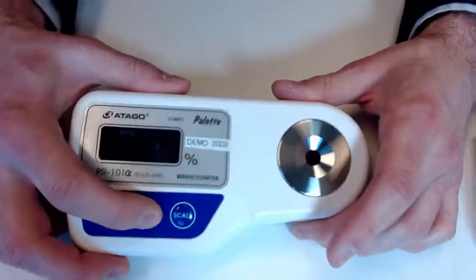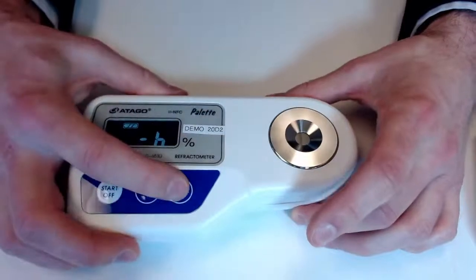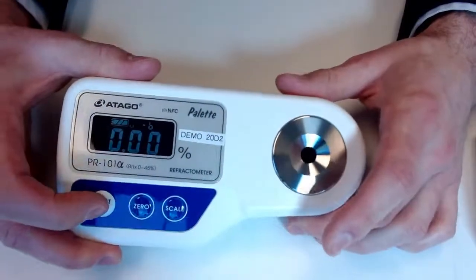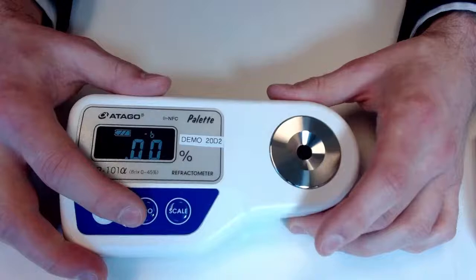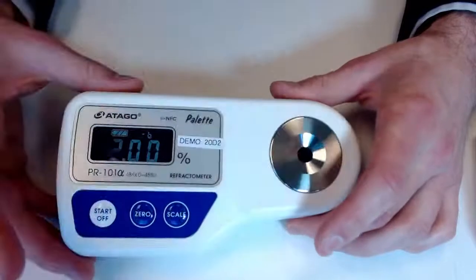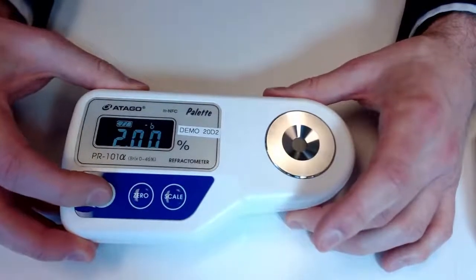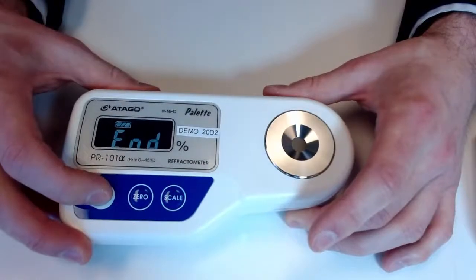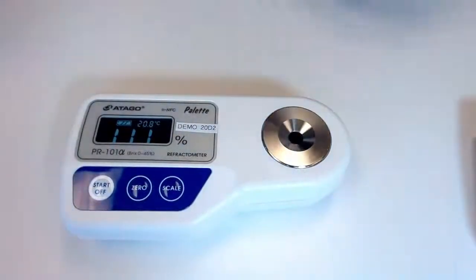So if I'm okay with that, I would hit start, but I want to maybe see if we can subtract. So for that, I'm going to hit start here, and here we get to tell the instrument how much we want to subtract, what value. So from there, you basically just remember that you're using 0 to kind of alter the value. Start is going to be the enter equivalent to put that in, right? So if I want to, just for example, subtract 2 from the value that would be normally generated, I can go ahead and hit start, start, start. And this here is going to be the coefficient. I think we're okay on that. So now, with that scale, scale 3, we're going to be basically subtracting 2 from our value.